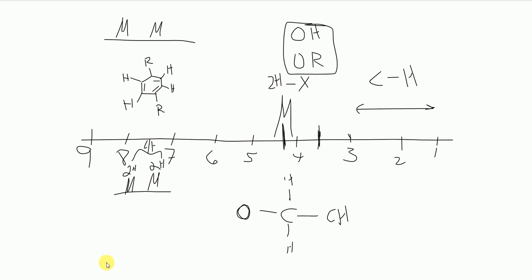So if this is kind of out of place or vague, I'll need to show you with the problems. And then the last kind of weird thing that you really need to know is when you have a singlet peak that has an integration value of 1H on it, this always means OH. Okay? This always means OH. And so that's what that refers to.